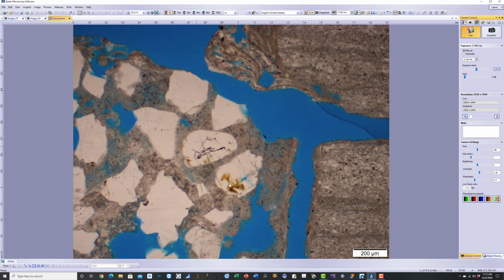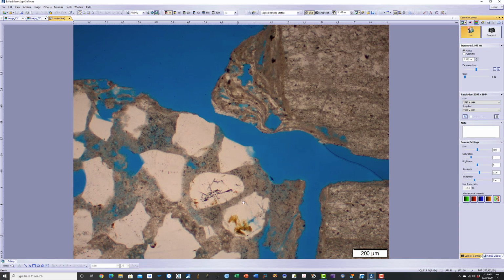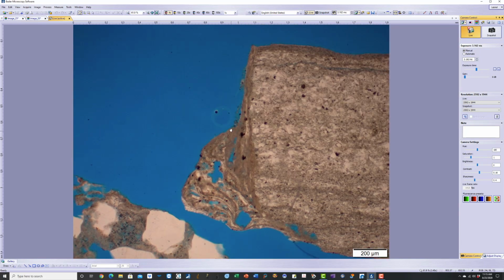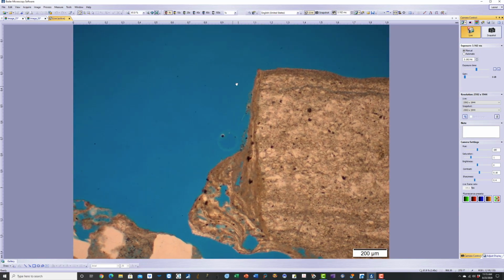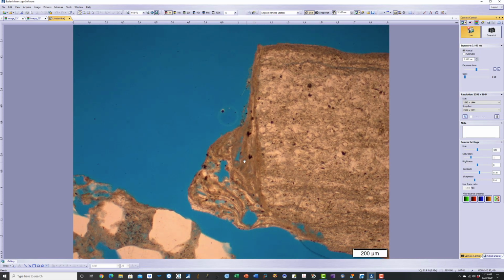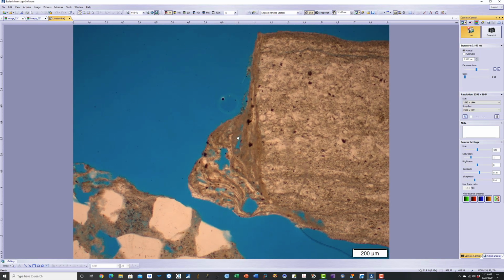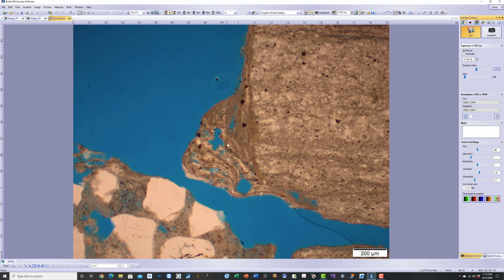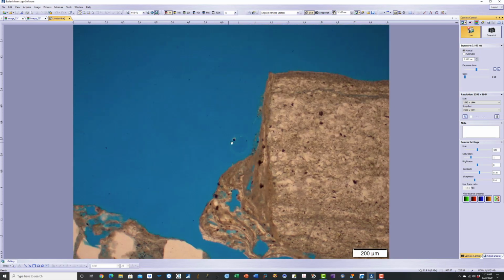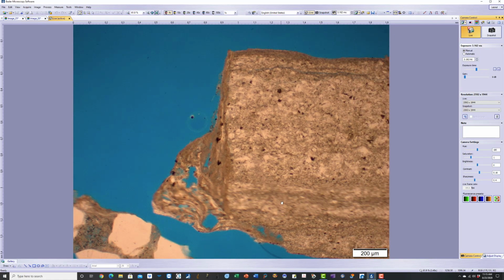Then that dissolved calcium hydroxide came out to the air, and then water evaporated, and it precipitated the dissolved constituents, which eventually carbonated in contact with atmospheric carbon dioxide and formed calcium carbonate. So that's how the efflorescence deposits are formed, preferentially at the interface between the stone and the mortar.